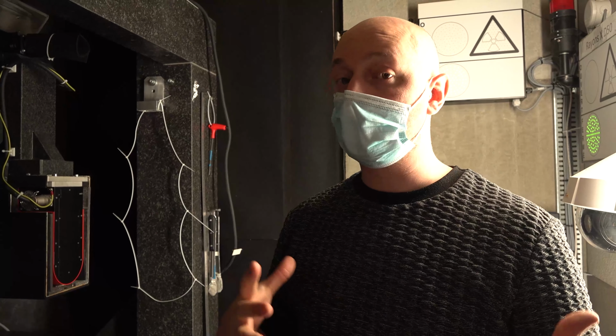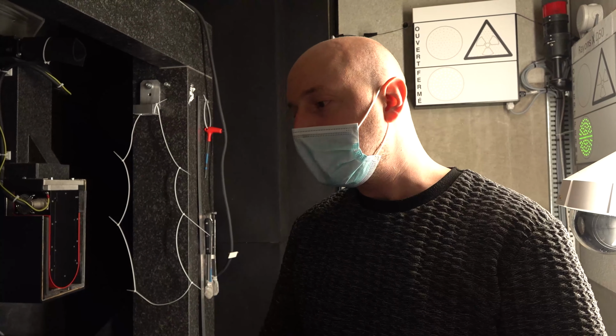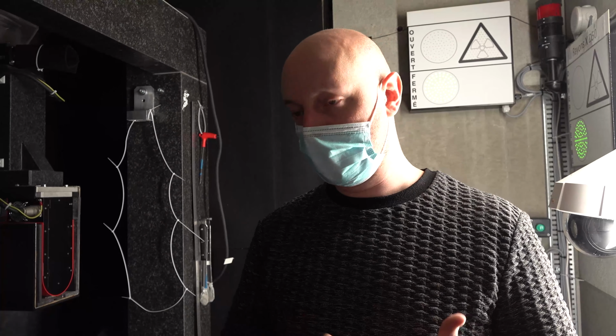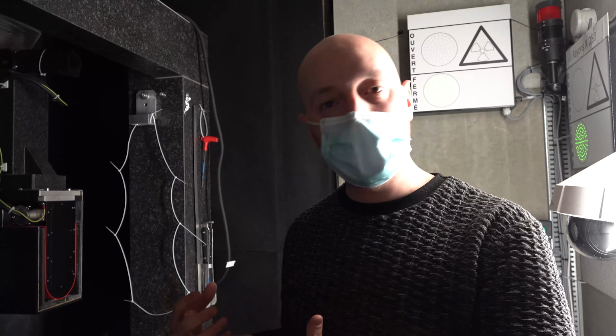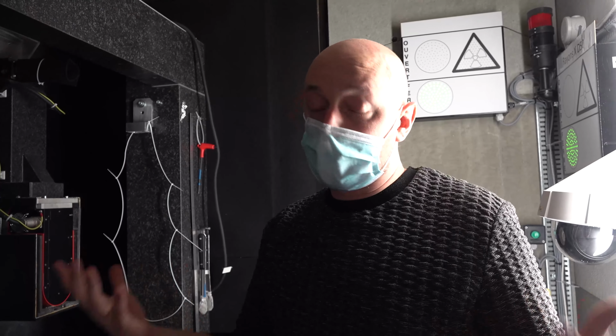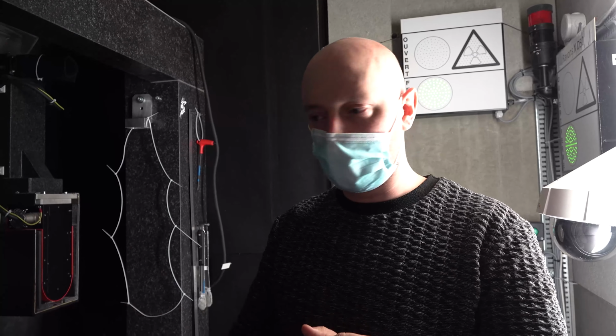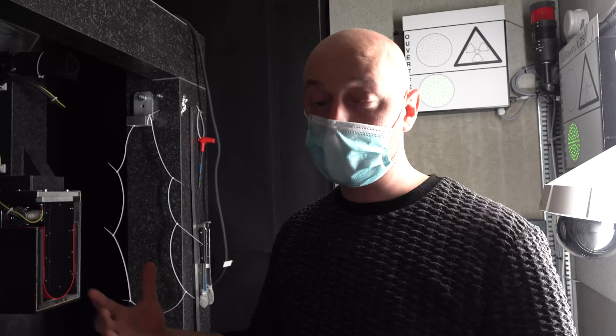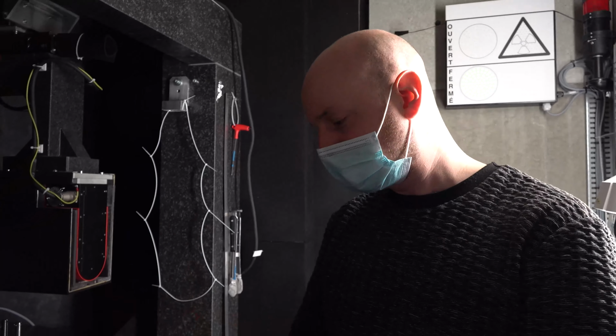In neutrons, this contrast is a little bit different. Light elements such as hydrogen and lithium will be very, very highly visible, whereas metals, which are very opaque to X-rays, will be almost transparent to neutrons. What I'd like to stress is these two techniques are very highly complementary, which is a bit the idea underneath the neutron and X-ray tomograph, which we have developed here.